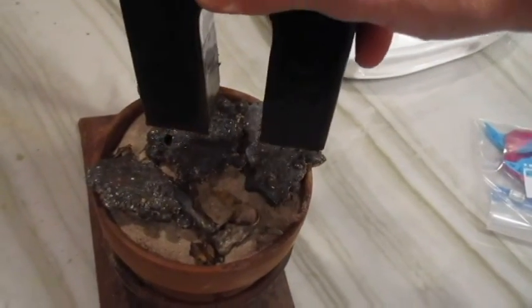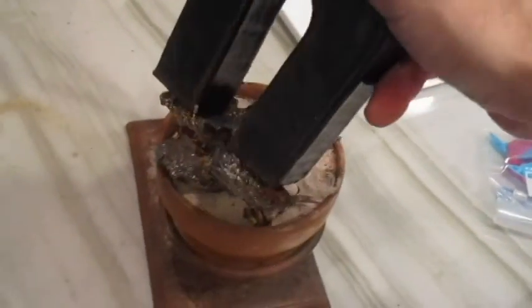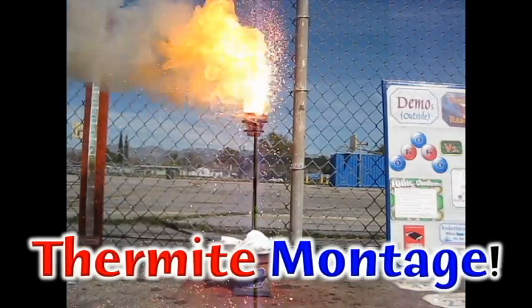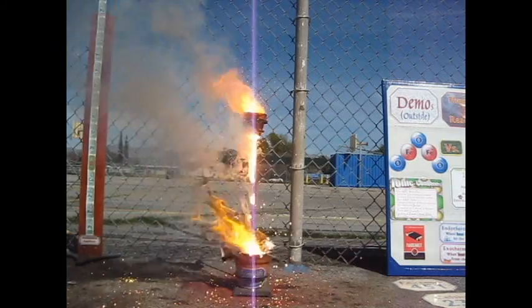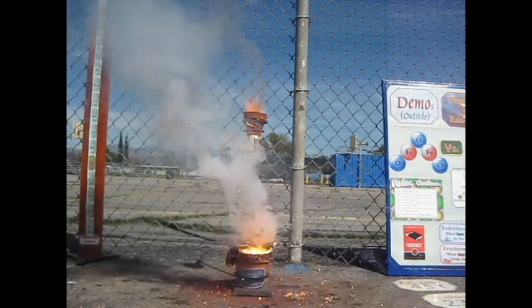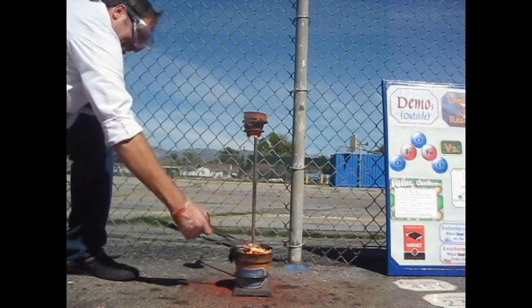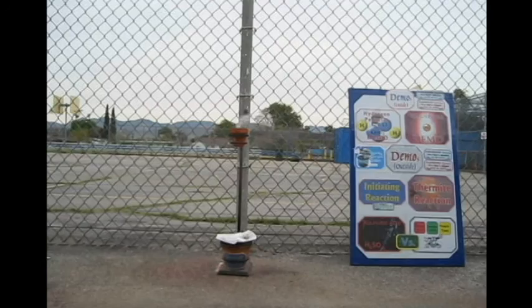Let's see. Magnetic. So let's see, that's the initiating reaction on the top. Watch the bottom. Come on. There it goes, molten iron. Molten alumina. Molten iron and alumina. Look at this. Molten, oh, look at that. That's why we have a circle.